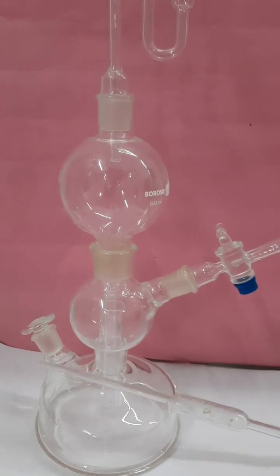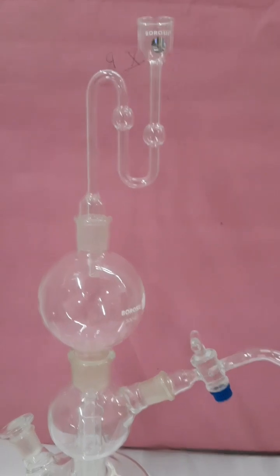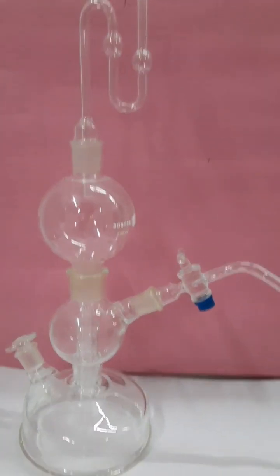Here is the stopper which is used to remove the unused acid after preparation of the gas.